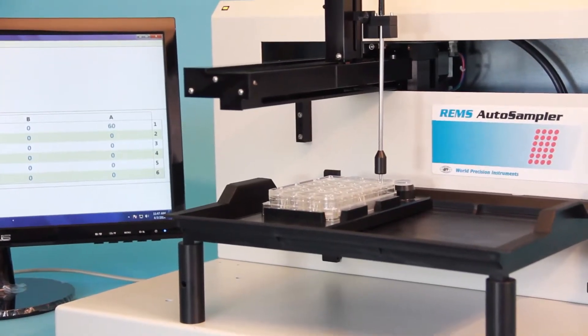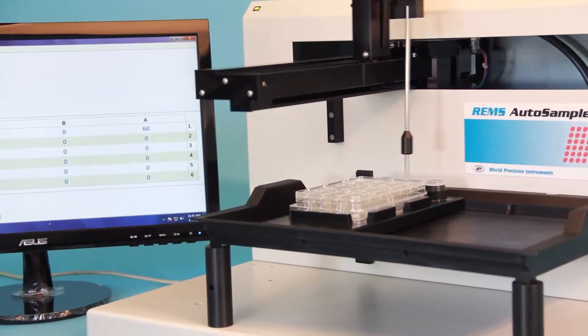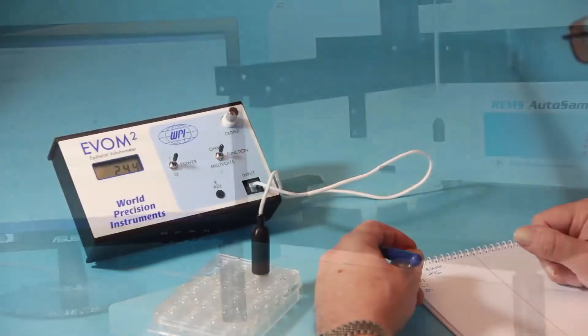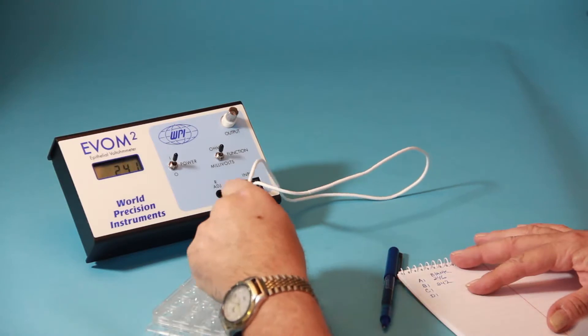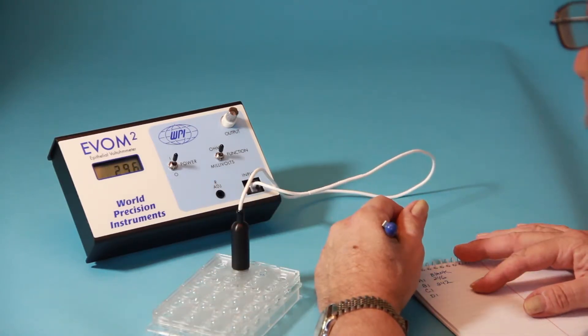WPI's REMS can record tier for 96 wells in as little as 5 minutes. In addition to the significant time savings, automated tier sampling eliminates a common source of inaccuracy typically associated with variances in electrode placement during manual measurement taking.